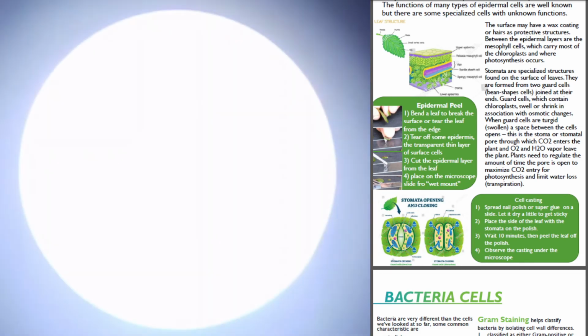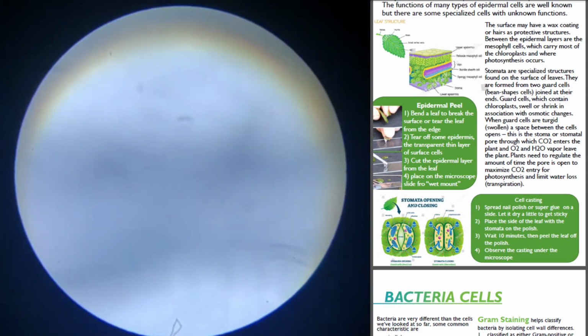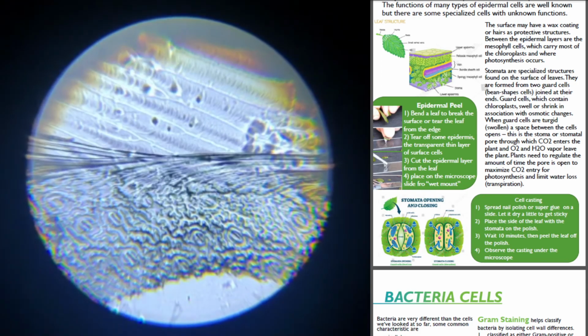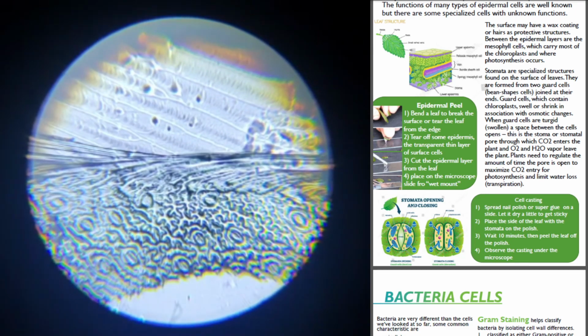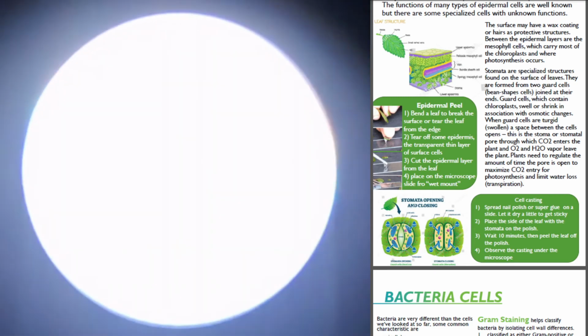Okay. Flipping and rotating the nose piece. Higher resolution. Sorry, higher magnification. See those stomata? Like little eyeballs there. Wow, look at that. Perfect. Let's go for one more. Oh, we're getting some of that polarizing effect from the tape. Did you see it?